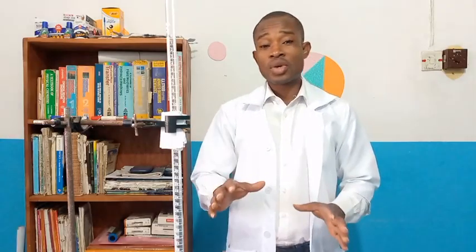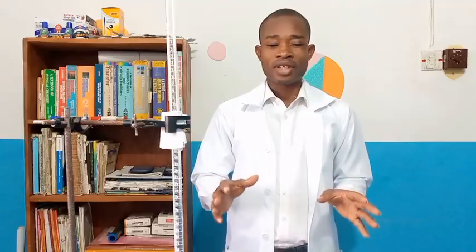The solutions we're going to use are ammonium iron(II) sulfate crystal, the hydrated form of it. Our aim would be to determine the number of moles of water of crystallization in this ammonium iron(II) sulfate. And then, of course, our potassium tetraoxomanganate(VII), otherwise simply called potassium manganate(VII).